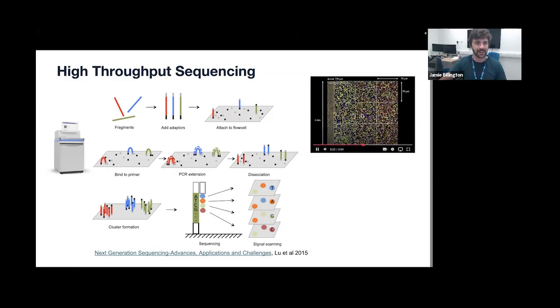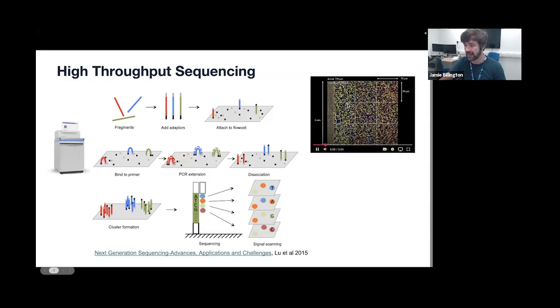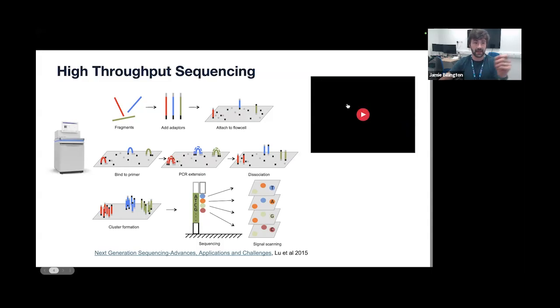It's kind of like a night sky, or like pictures of the Hubble telescope wide field, where each of these spots represents a cluster of reads, and each of those spots also originates from a single fragment. You can see there are many millions of these spots, and their evolution over time represents us iteratively figuring out which base is present at which position along the read.